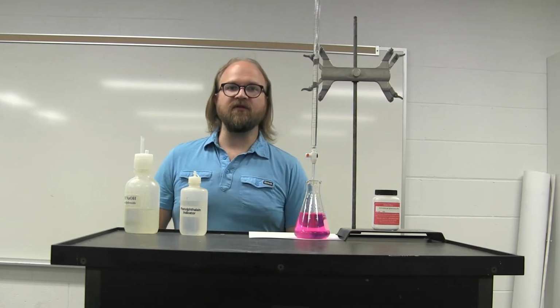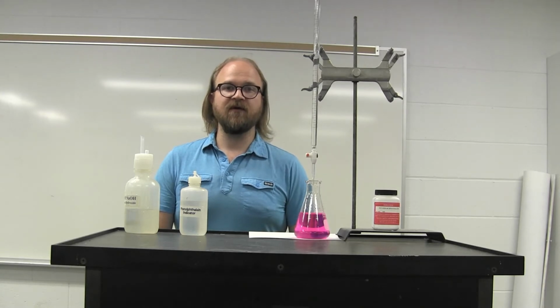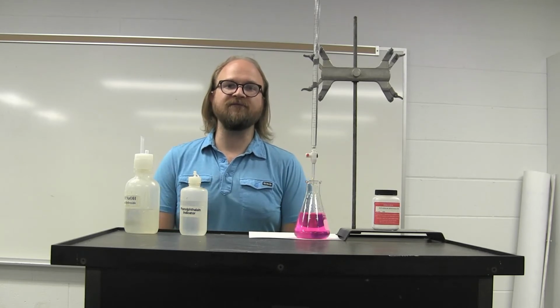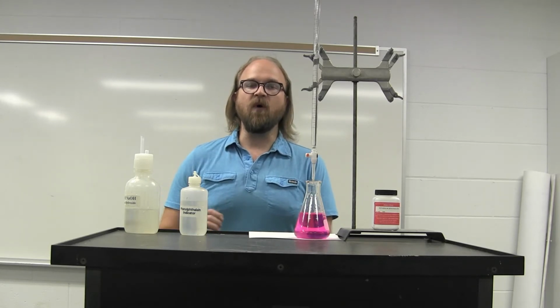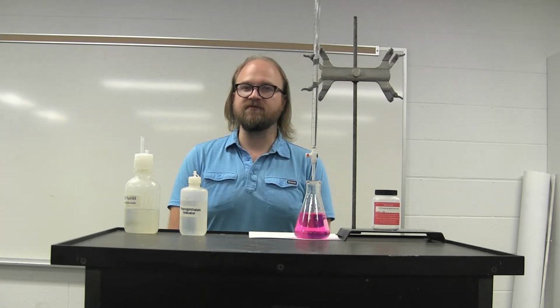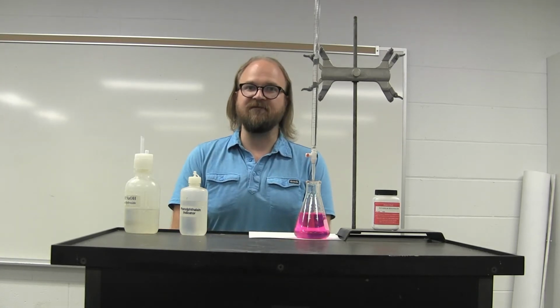You're also going to be looking at the titration of sodium hydroxide with phosphoric acid. Phosphoric acid is a triprotic acid, but you can look at the first two equivalence points. As you do that particular titration, there will be no indicator, and you'll be preparing a titration curve to determine what are the equivalence points and what types of indicators could be used to perform that titration to obtain a specific point.